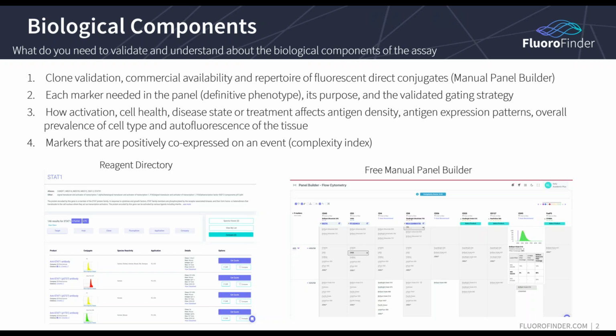That particular consortium has been working for a long time on taking all of the CD antigens and putting them into a particular backbone in order to understand how they express on different subsets, like naive B cells, or just general lymphocytes, or B cells, or dendritic cells, or PDCs and MDCs, just kind of the gamut of cell types.